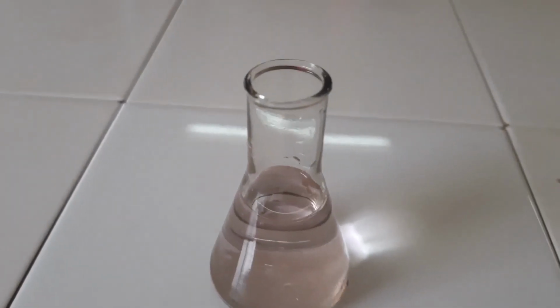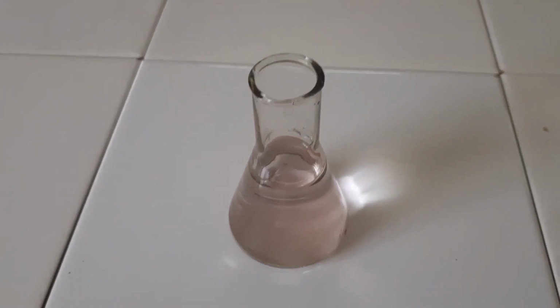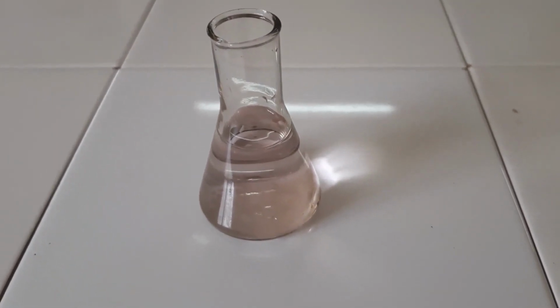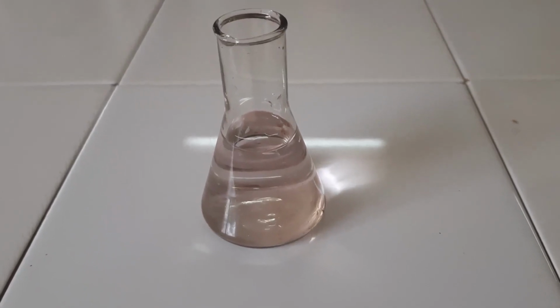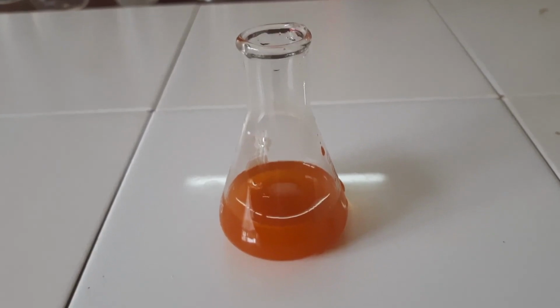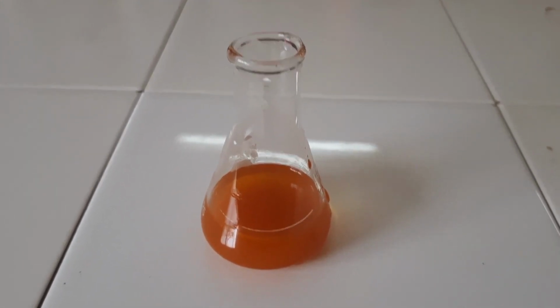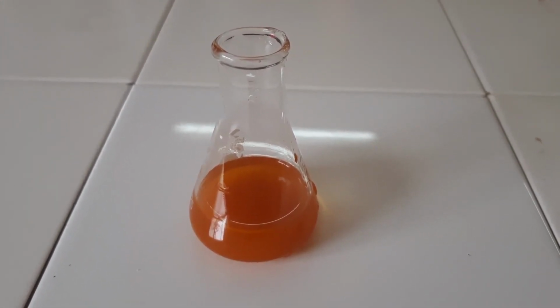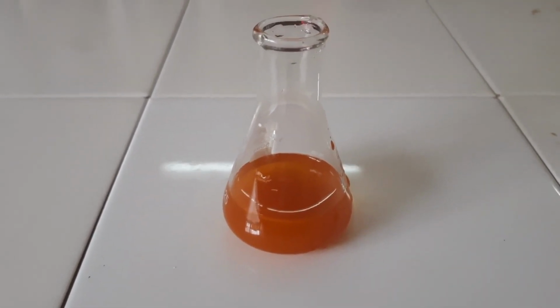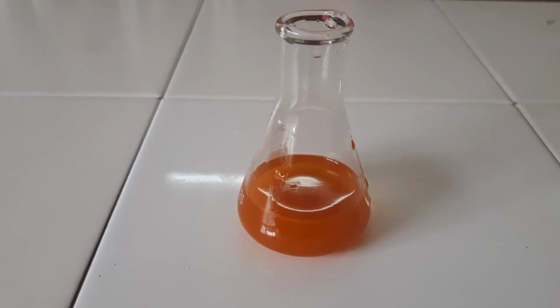Now this is a solution of manganese 2+ ions, Mn2+ ions. It is light pink in color. Right, now you can see a solution of ferric ions or Fe3+ ions. Its color is yellow brown. Fe3+ ions are yellow brown in color.